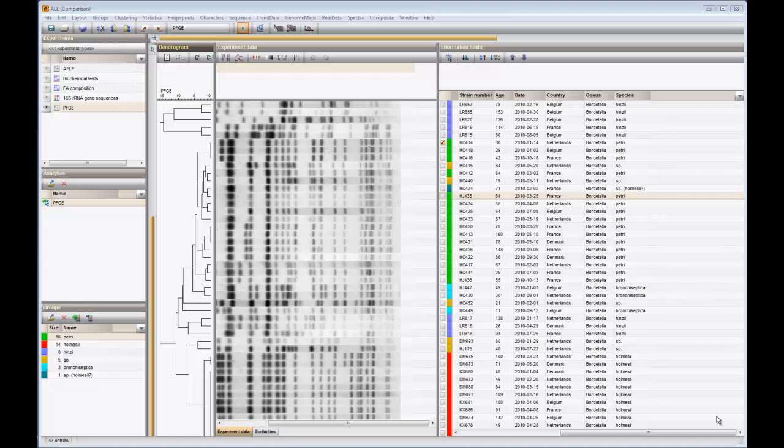The tree shown in this comparison was calculated from Pulsed Field Gel Electrophoresis banding patterns using the distance coefficient number of different bands.